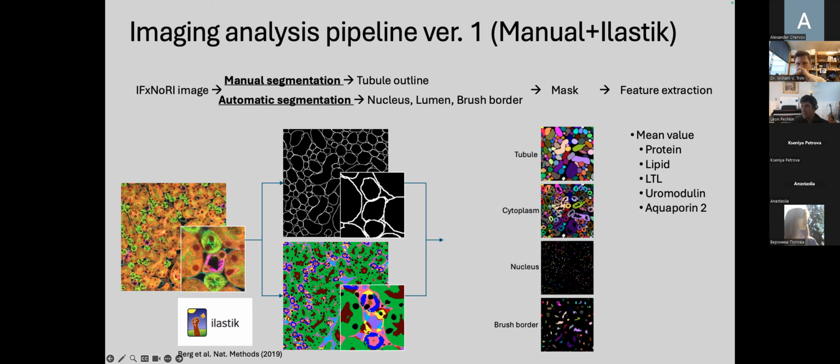Whereas I imagine that the proper machine learning approach here is bidirectional information flow, right? If we think of how the human eye parses this picture, the information flows both ways. Identifying an elliptical shape of a certain size as a nucleus is informed by local context and vice versa. Okay, so I think that's an important point about this particular challenge. Not all organs are going to be hierarchically structured like that. But yeah, anyways, enough said.